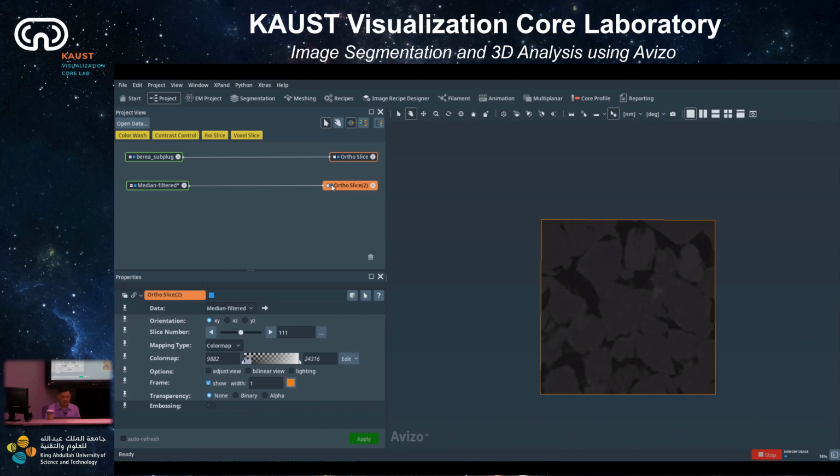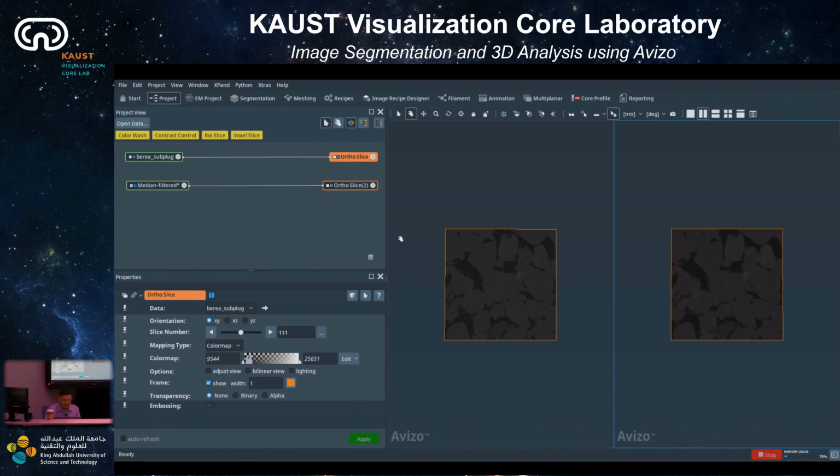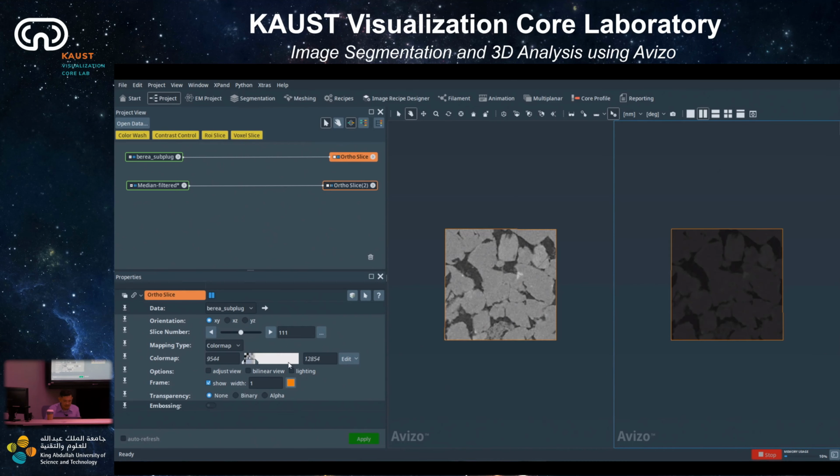Again, you need to understand that if you click on an object with the 2 data sets, you will see like this. And that's why we have this multi-viewer. So if I click on the 2 viewers and then press spacebar for each viewer like this, then we adjust the dynamic range to the same value, say 12,000. Yeah, 12,000.